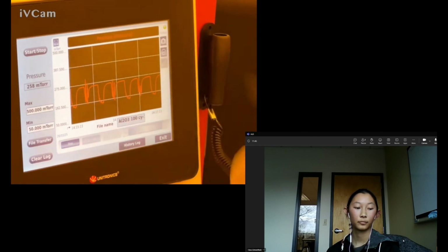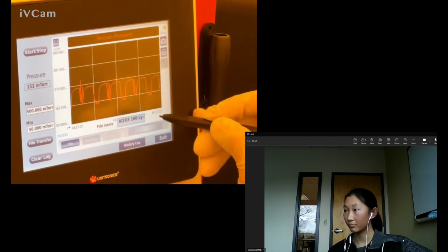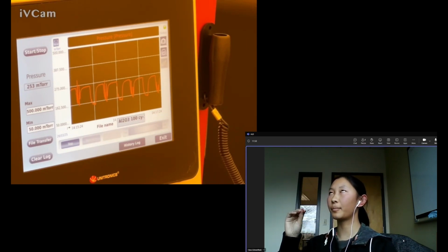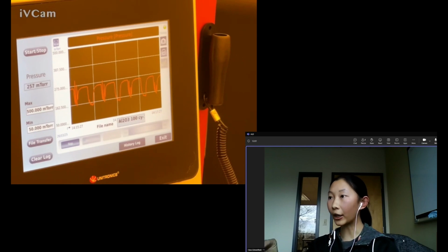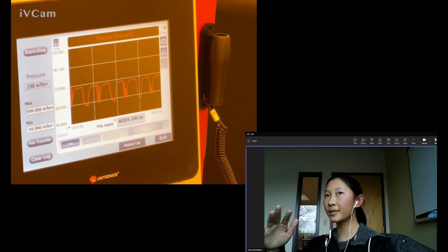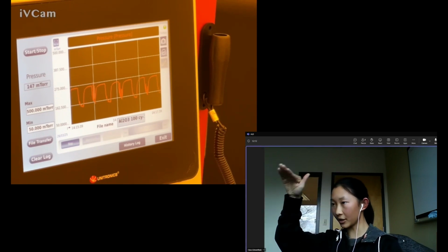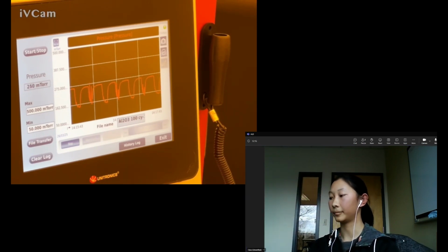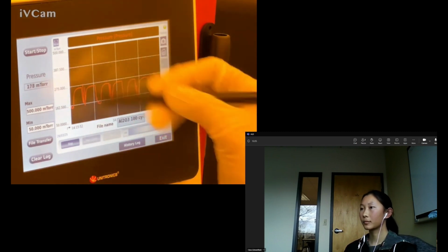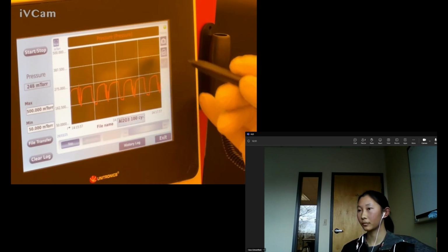So this is okay. This is expected. Because here we are no longer seeing those peaks. Since the purge flow is higher than the standby flow, it will increase the pressure during that purge flow time, which is why it's all level at the top. So now we are not able to see those peaks anymore, maybe just a few peaks.